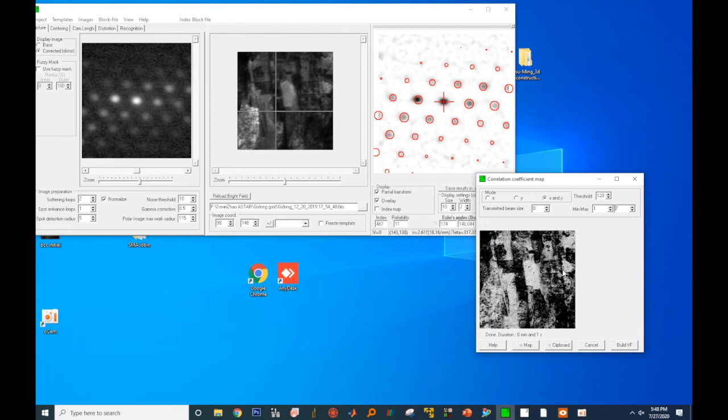If the pixel we have is very similar to the neighboring pixels, then the correlation coefficient is high and the pixel will be bright. If the pixel is very different from the neighboring pixels, the correlation coefficient will be low and the pixel will be dark. The correlation coefficient maps usually resemble pencil sketches.